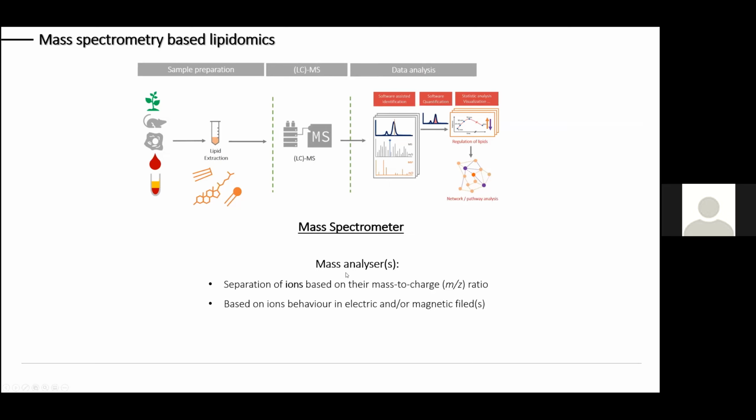We can perform our mass analysis only if we manipulate ions, as obviously only they will respond to these electric and magnetic fields. So if we have to manipulate ions here, it implies that we have to ionize our analytes. That's why a very important part of any mass spectrometer is also an ion source, where we form ions from neutral molecules. And usually we want to do that without decomposition and additional fragmentation events.